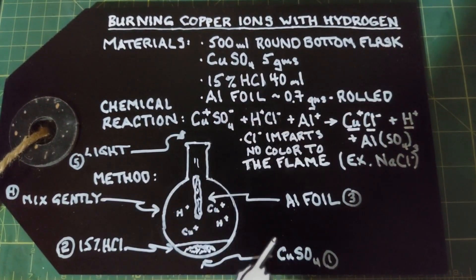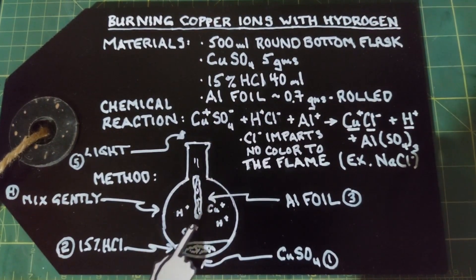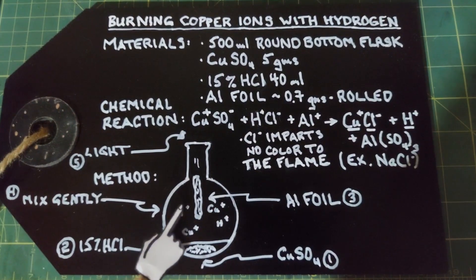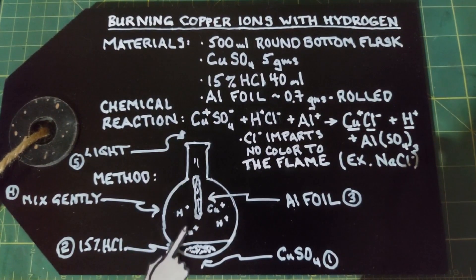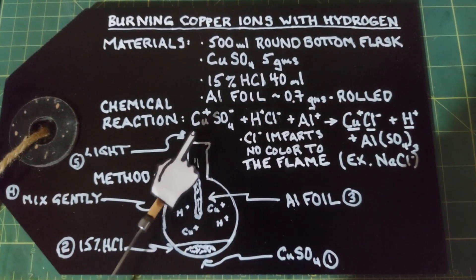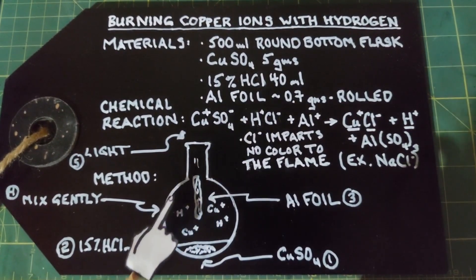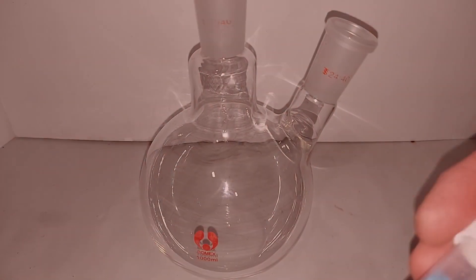The method is really straightforward: put in your five grams of copper sulfate, pour in your 40 milliliters of hydrochloric acid, swish it around gently to get the reaction going, then drop your aluminum foil in, which will release the hydrogen. Swirl it gently and as this all gets mixed together you're going to end up with copper and hydrogen in the surrounding area. Light it with a flame and it may go in and gently burn or burn off the top — either way you get a really pretty, unique blue-green flame that sort of wafts about.